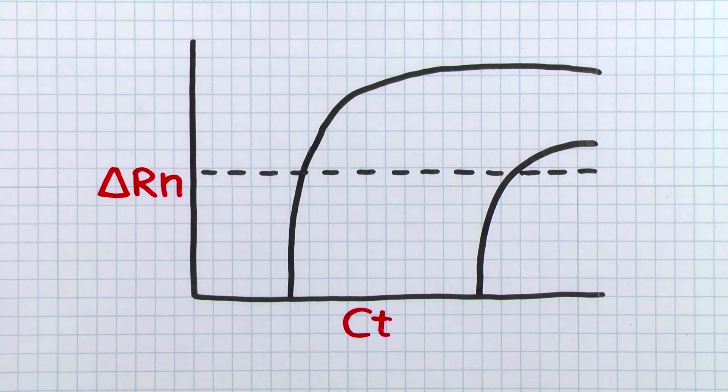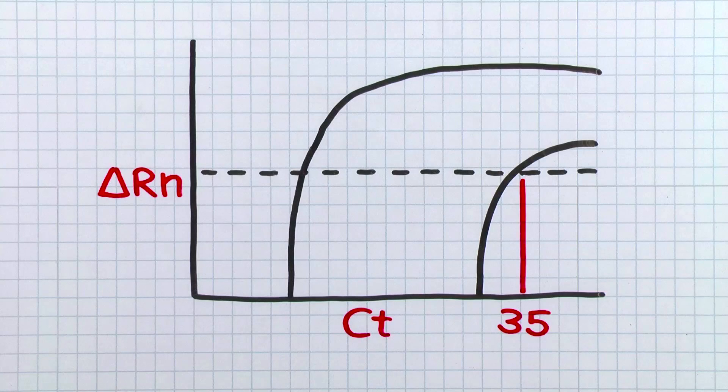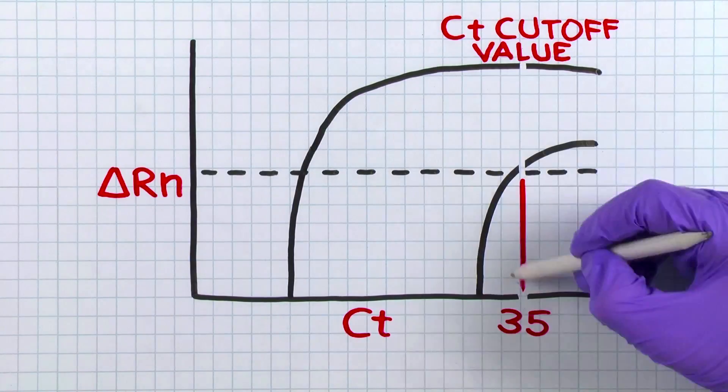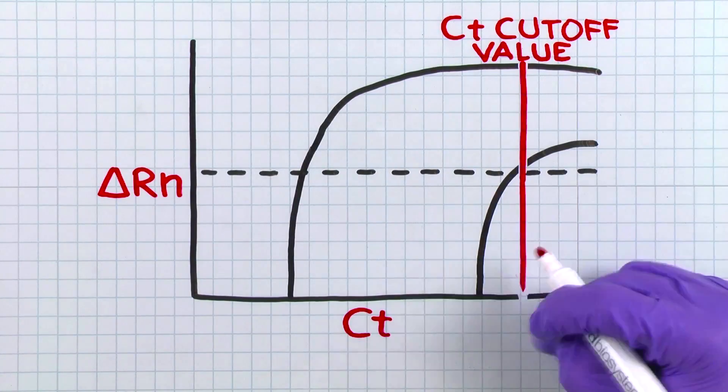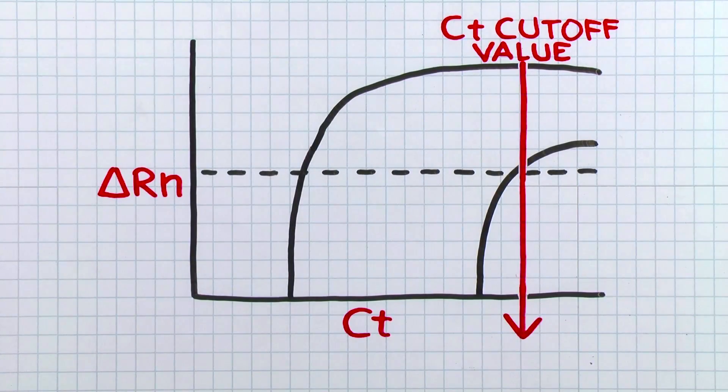If the CT value gets too high, say a CT of 35 in a 96-well plate, it can be difficult to distinguish real signal from background. For this reason, many researchers will employ a CT cutoff and not use any data above that CT value.